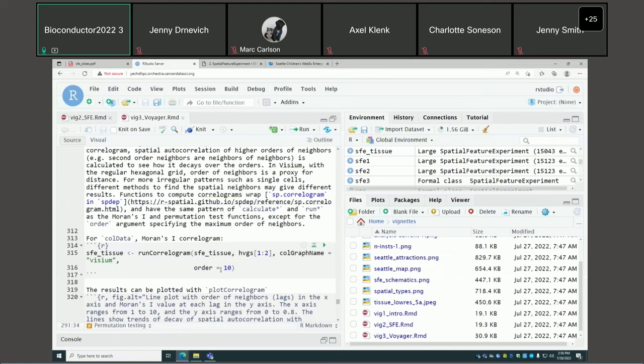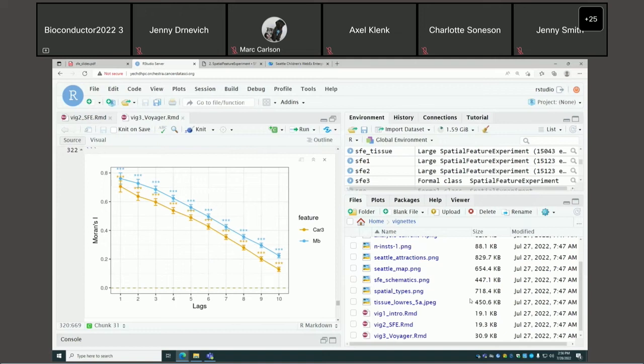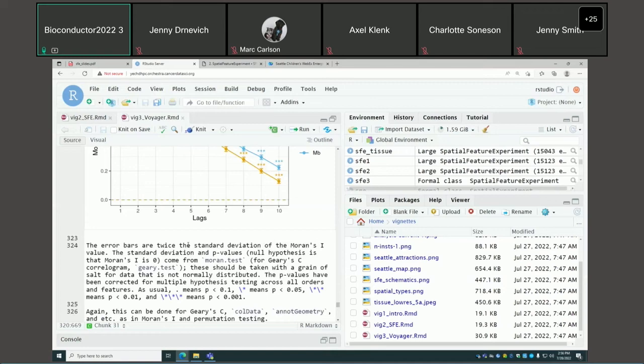With a correlogram, we can see the length scales of spatial autocorrelation. It can be done for Moran's I and Geary's C. Here we do two genes. Not only does it show the length scale decay, but sometimes you may see that second-order neighbors have higher values than first-order because there's some negative spatial autocorrelation in some regions of the tissue.